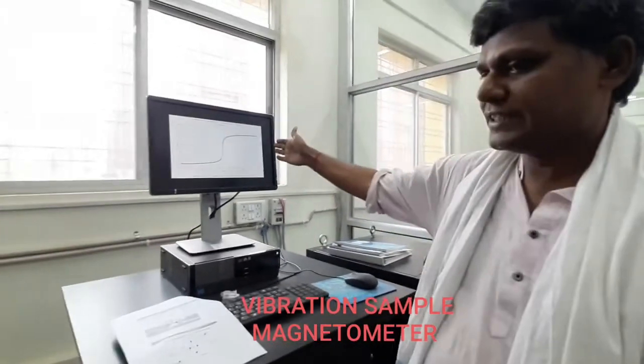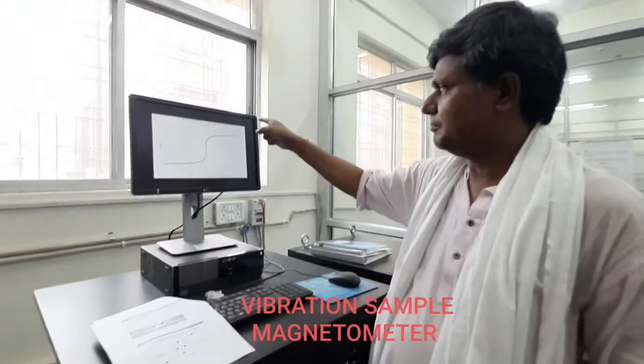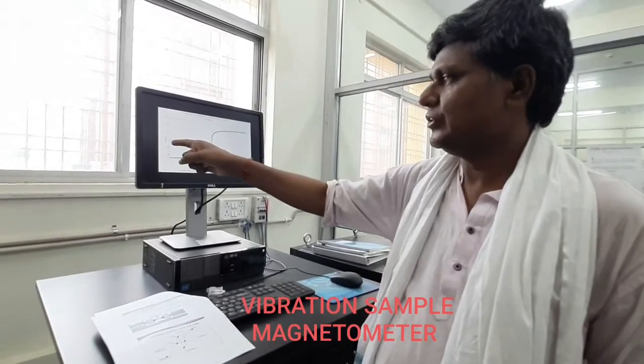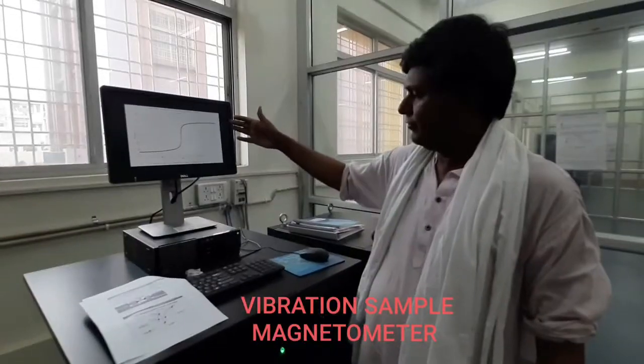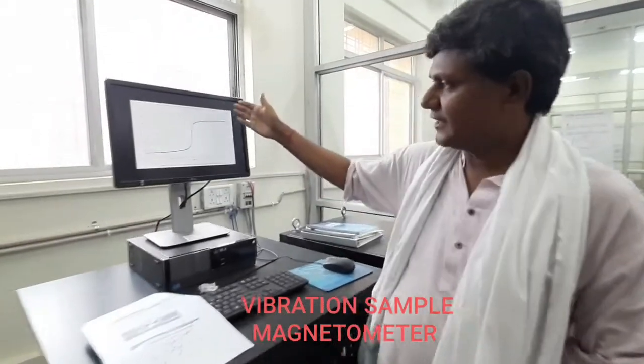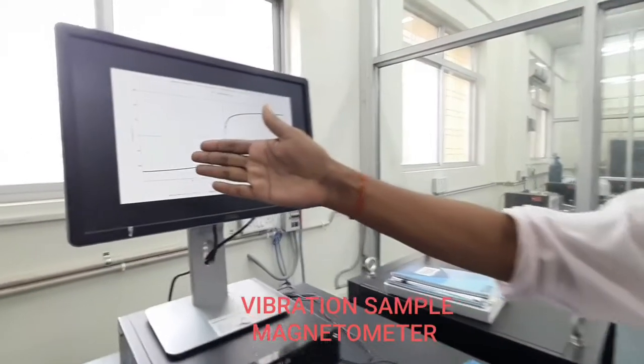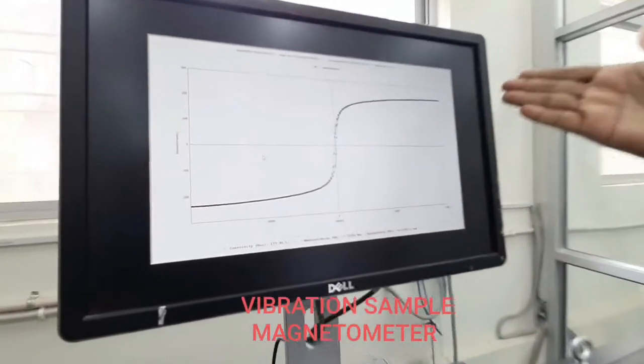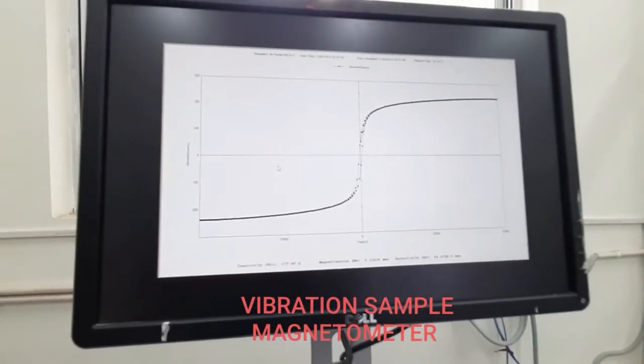On this screen, this is the magnetization curve we obtain. We focus on the magnetization curve visible on this screen of this sample.